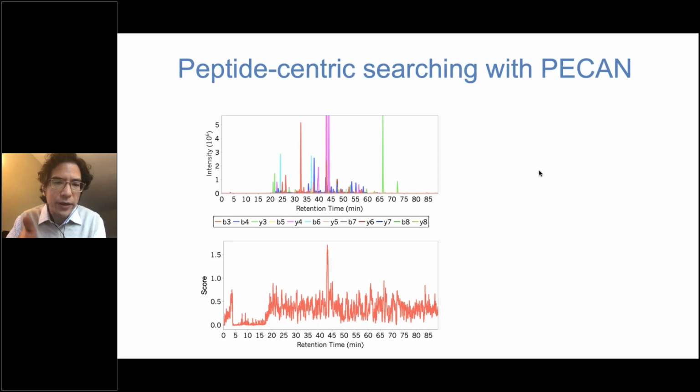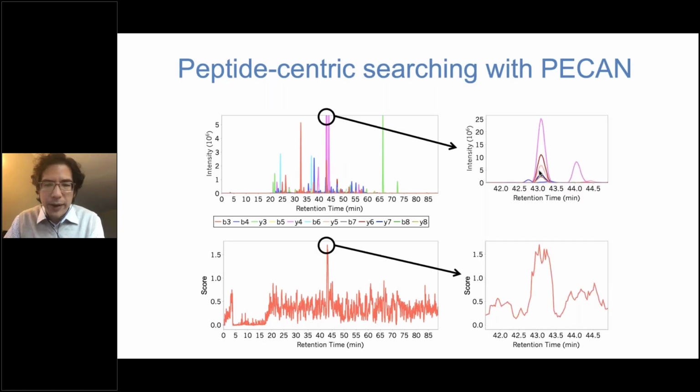You would actually score each of those scans, and at each of those different scans, after deriving a score, you would see that there would be a potential peak in those score distributions. If you were to zoom in around that peak in those score distributions, that would be the way in which you would determine that this peptide was present, and how confident you were in that score set.